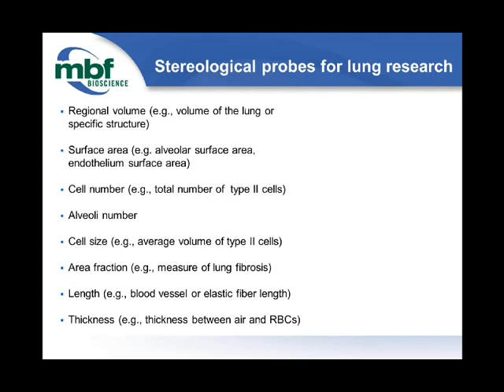Okay, so once you have your experimental question in mind and know what type of data you need to visualize, and get the histology working and figure out the sampling scheme, now it's time to visit the different sections and actually do the probe. And this is a list of different types of data that's useful to lung researchers.